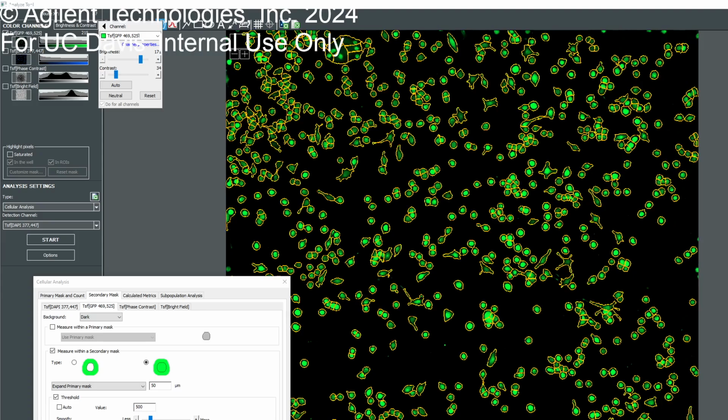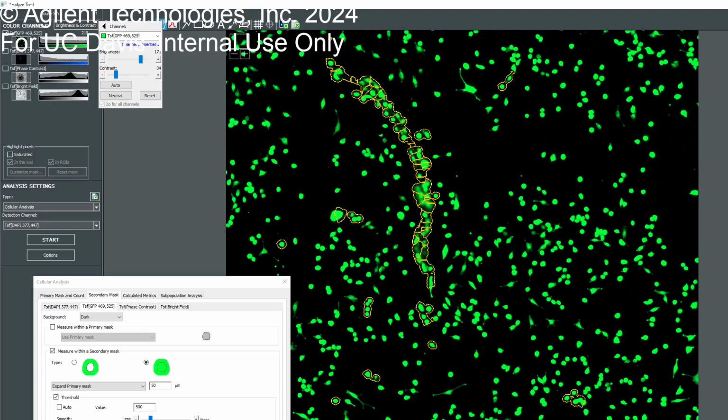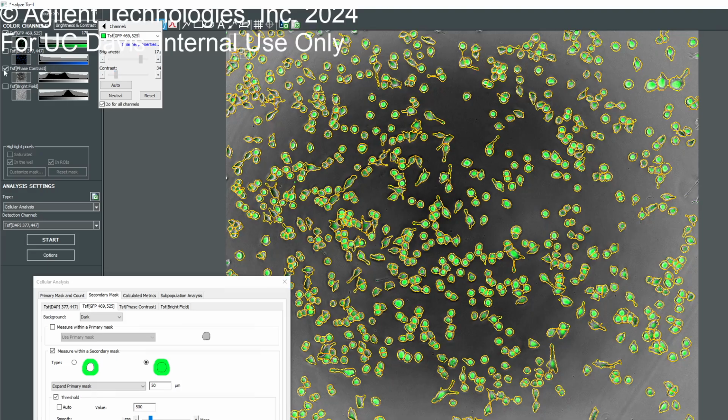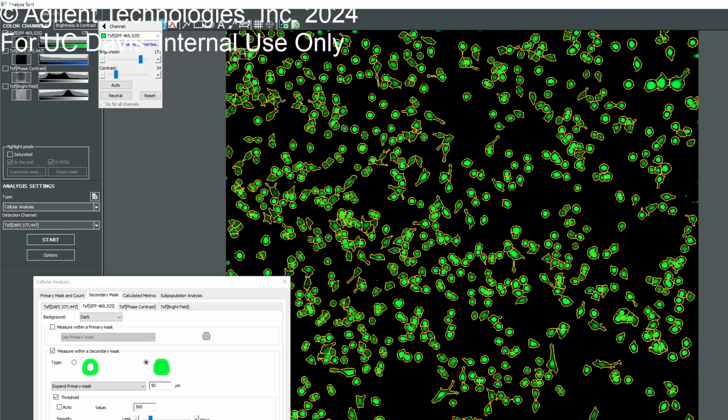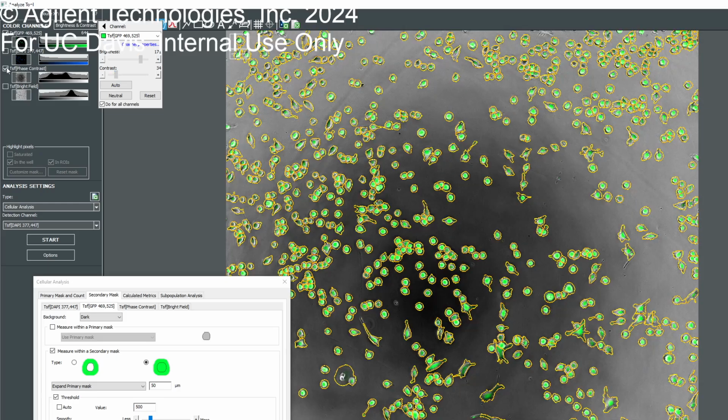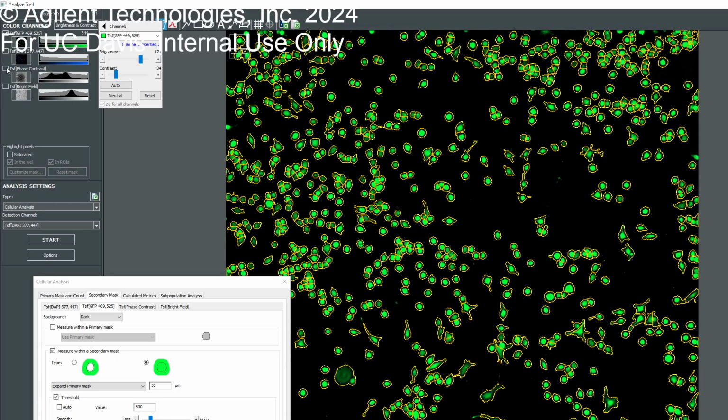Okay, I mean, it's acceptable. If you look at these images, is that still the same? Not the same. I think this is still pretty good, and it's catching more information. Actually capturing it very well. So once you're satisfied with that, then you just add step, and that will add the step to the workflow.